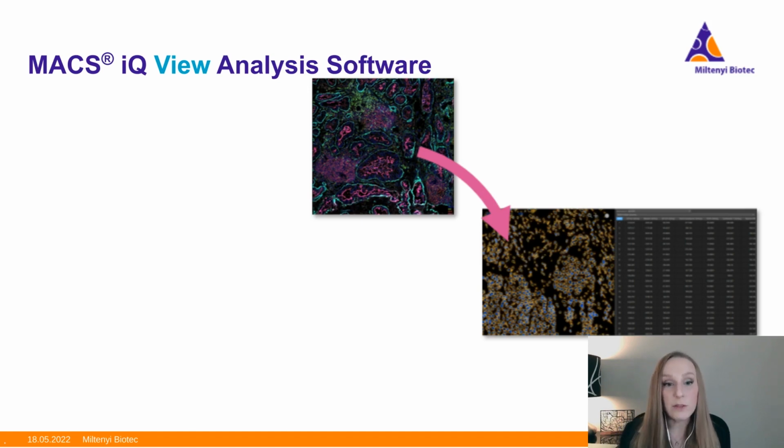On top of that, once you're able to identify those individual cells, like we see in the picture on the right, we're also able to extract all of these features. Again, there's no math that we have to do. The software is going to identify those and then spit out those features, so you don't have to think about what you need until downstream, about the different features or the different measures that I want to compare for my particular system.